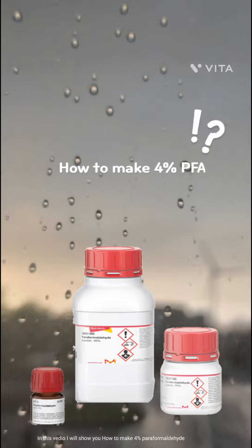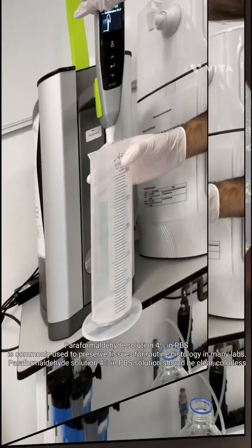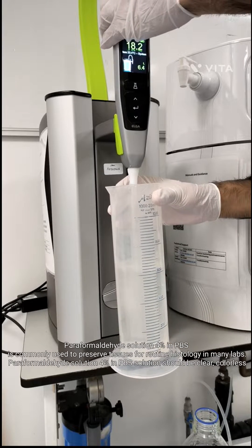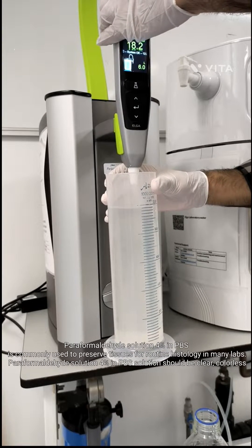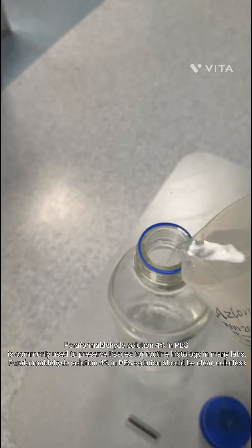In this video I will show you how to make 4% paraformaldehyde. Paraformaldehyde solution 4% in PBS is commonly used to preserve tissues for routine histology in many labs. The solution should be clear and colorless.